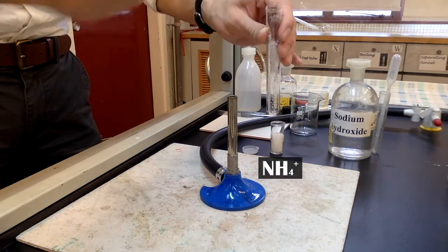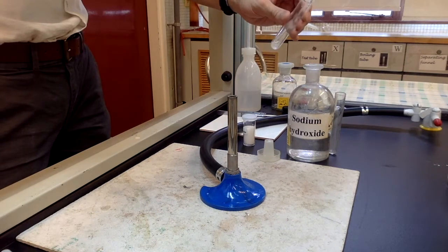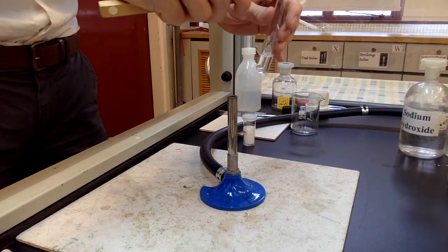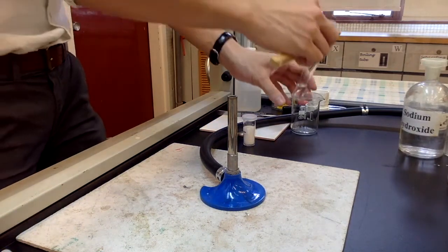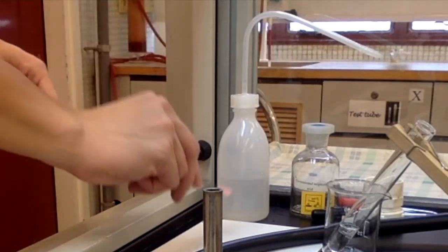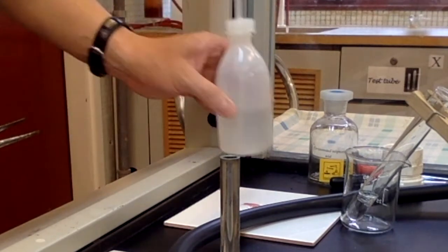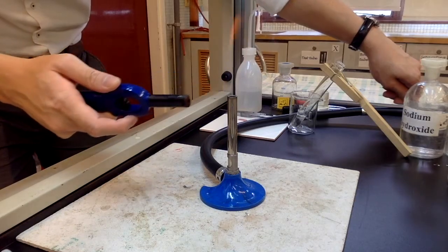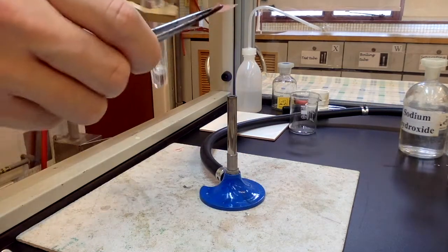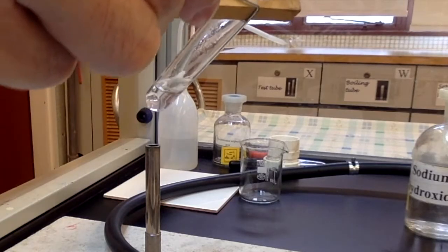Transfer ammonium chloride solid into a test tube. Add dilute sodium hydroxide solution into the test tube. Heat the reaction mixture and place a moist red litmus paper near the mouth of the test tube.